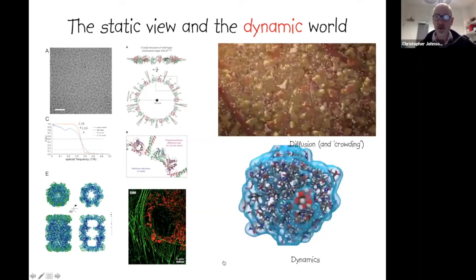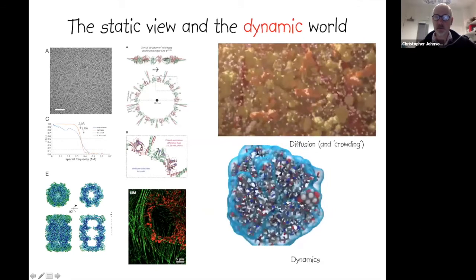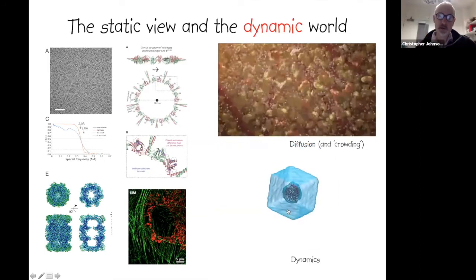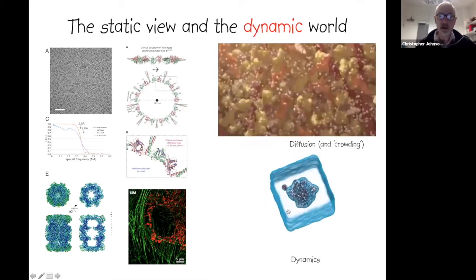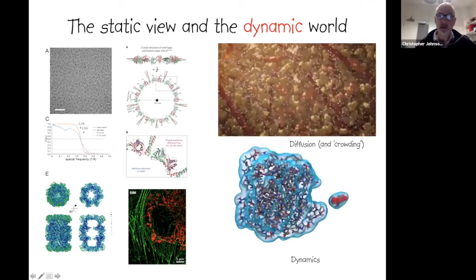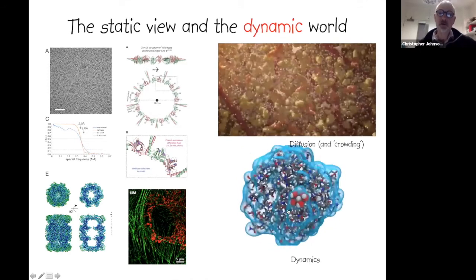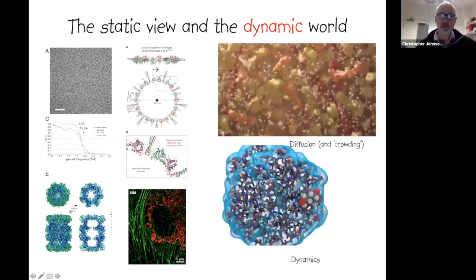And here also is the participation or the incorporation of solvent within the observation of this molecule. And solvent is something that I'll discuss in a bit more detail in the talk about calorimetry next Tuesday. But essentially the point here is that dynamics are going on all the time, and they're an important part of biology. So having methodologies that allow you to observe them is really very an attractive prospect.